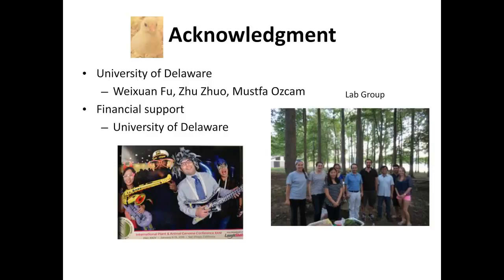If we want to create a gene model, it needs to be multiple tissues. If I'm working in one tissue, I would be confident that the gene model also covers where my gene ends. But yes, that's possible. This technology needs to be applied across many more tissues to be able to provide models that will work with every tissue.